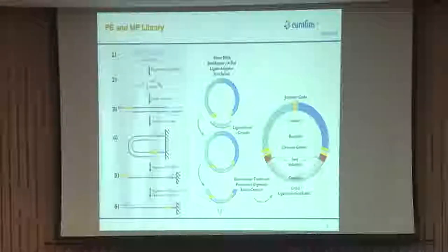Now, Illumina sequencing chemistry is bridge amplification. What is bridge amplification? In my flow cell, I will have one complementary pair of the adapter. Now, this will attach and it forms a bridge. This is getting attached, this will go here and attach. The non-template will wash away and the other template will amplify.